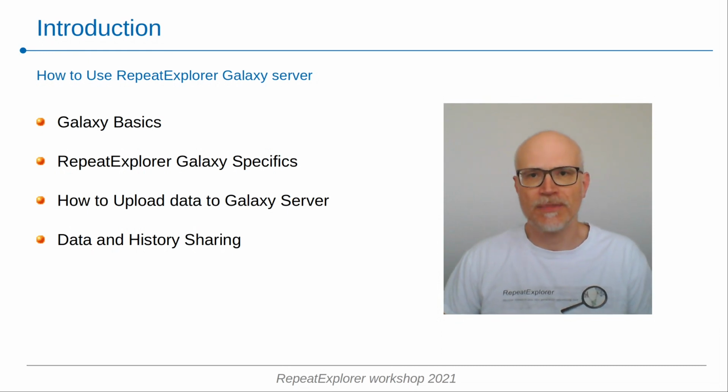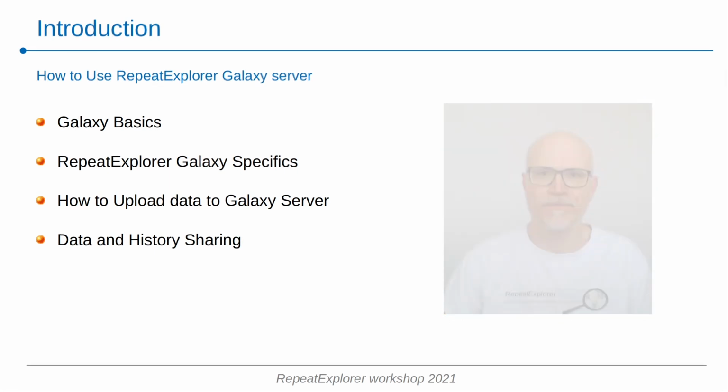My name is Petr Novák, and I will show you how to use RepeatExplorer Galaxy interface, how to upload data, and how to use sharing features in the Galaxy.